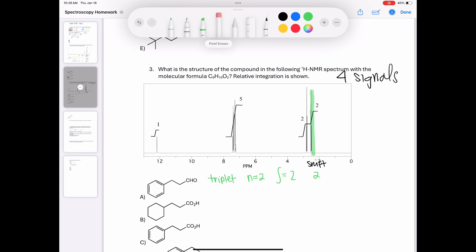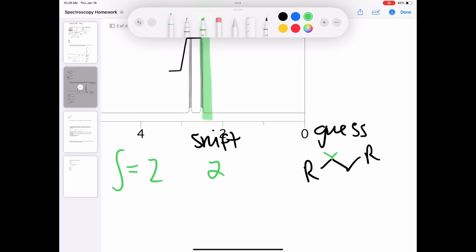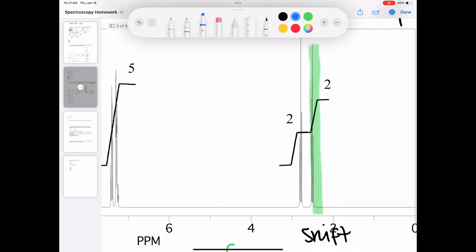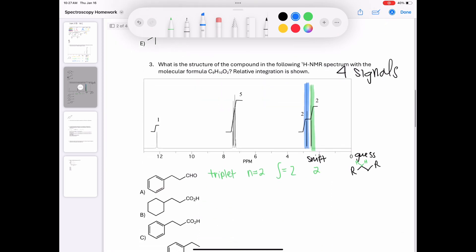For the first triplet: the N value is two, the integration is two, and the shift is right around 2 parts per million — I'm guessing it's part of a CH2CH2 group. There are two triplets both around 2 parts per million that both integrate to two, so we need two environments each integrating to two with only two neighbors. The second triplet highlighted in blue has the exact same N value, integration, and roughly the same shift, so it seems pretty likely there's a CH2CH2 motif.